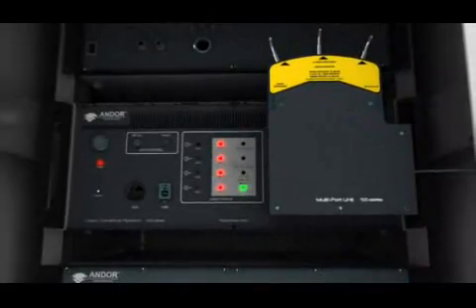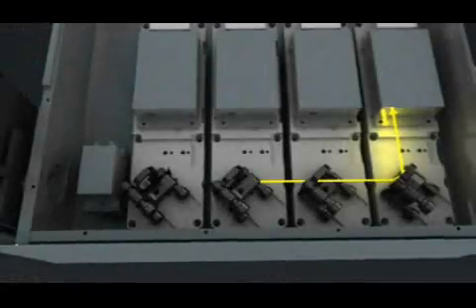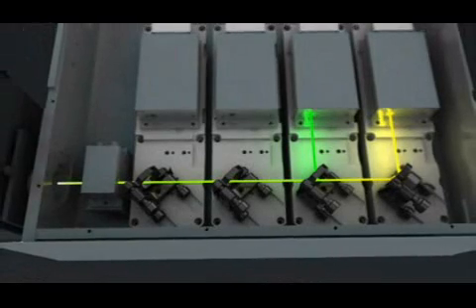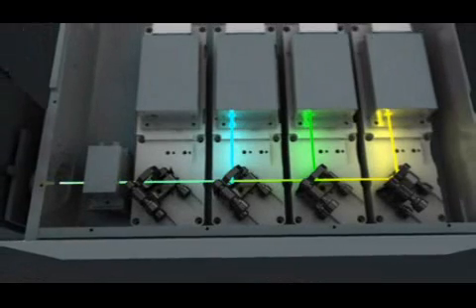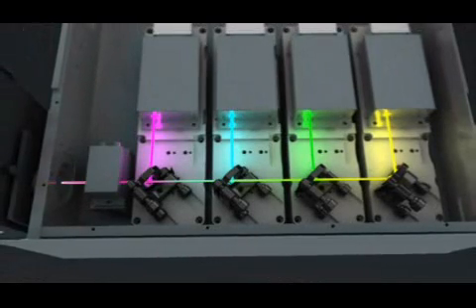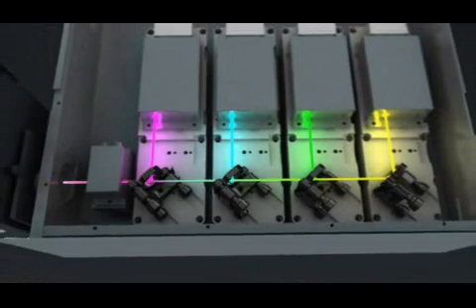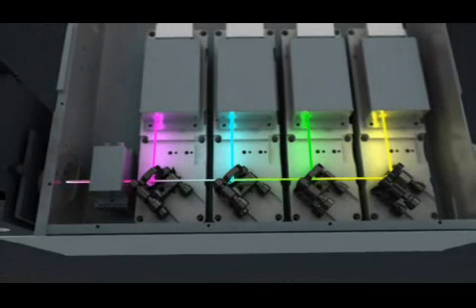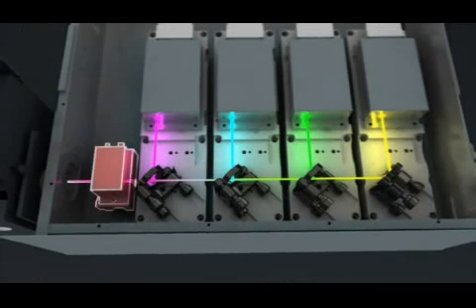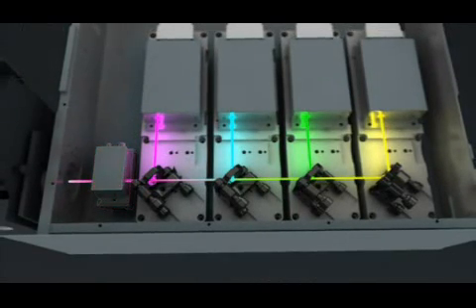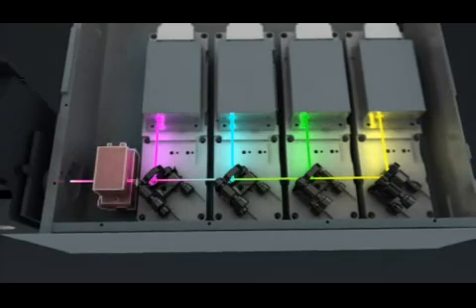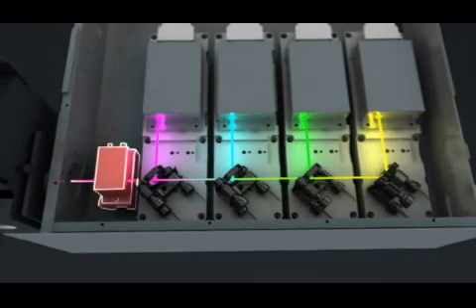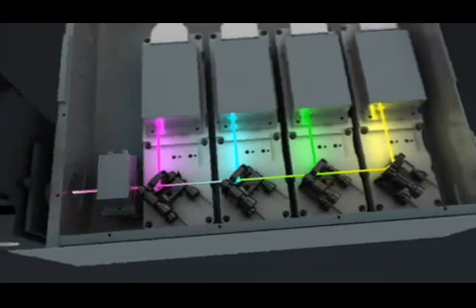The highest quality solid state lasers and ultra stable mechanical platform deliver up to 5 user selected wavelengths via optical fiber. The built-in acousto-optic tunable filter provides microsecond control and effectively eliminates crosstalk.